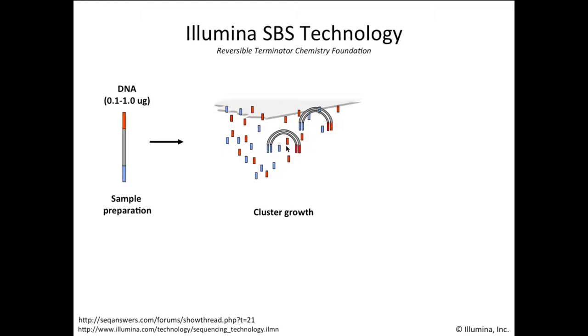Okay. And essentially you continue to do this operation by releasing one of the ends and continuing to expand, doing this bridging and this amplification. You continue doing these operations until you get a very large number of copies of the same DNA fragment at the same location. Okay. What's the goal of this? Why do you have so many copies of the same fragment like this? How is it going to help you?